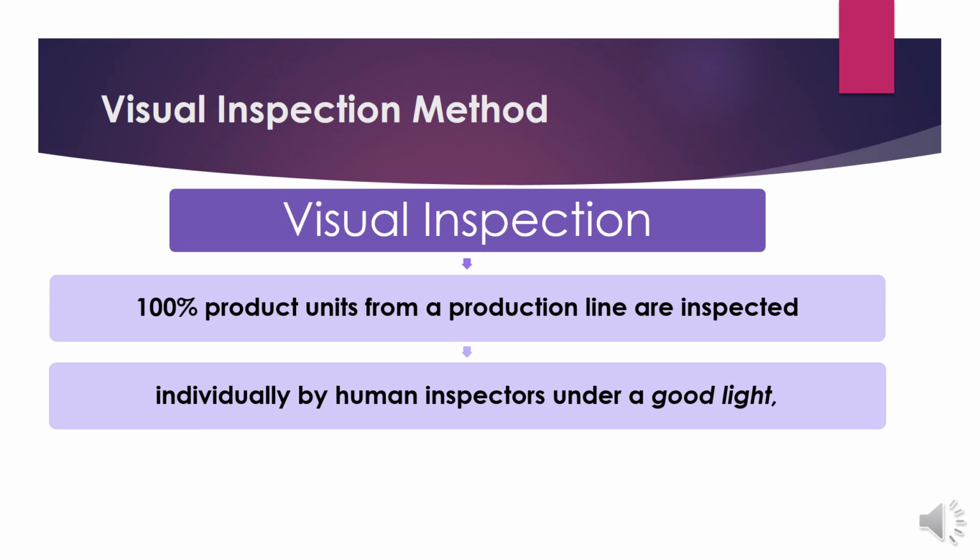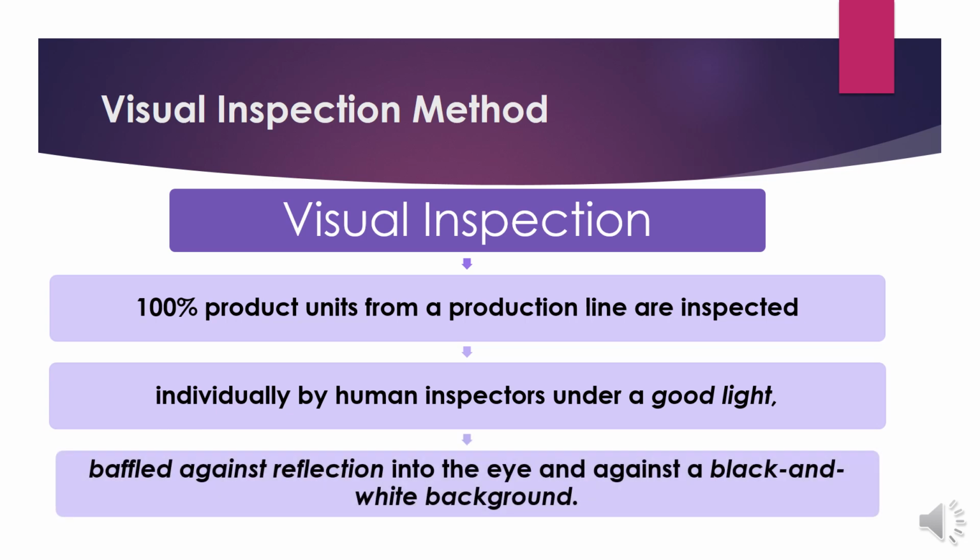The lighting must be proper so that all the visible particles can be observed by the human inspectors, and the light must be baffled in a way that it is not reflected into the eye of the inspector who is inspecting the product units.